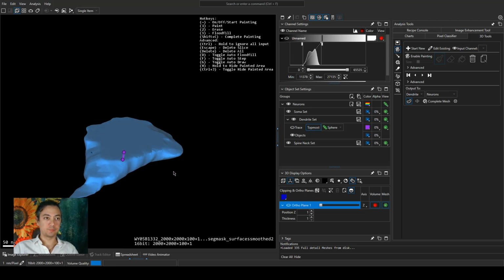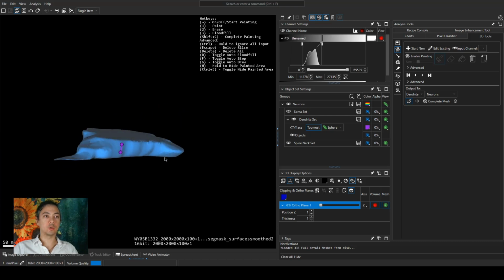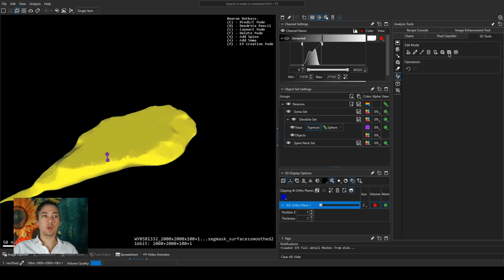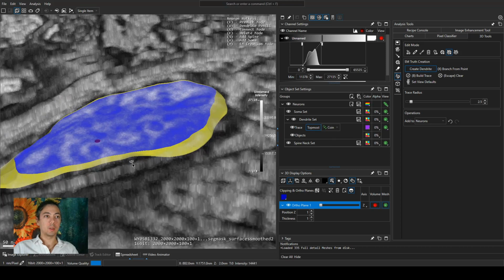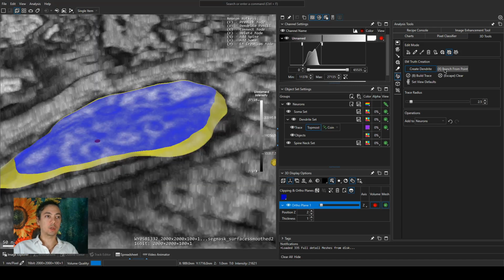there it is. So the last thing you might want to do after you've adjusted any contours that you wanted to is fix up the center lines. And so I actually like coin mode, and we're going to use the EM create mode. Oops, need a channel, and then like this. And we'll say we can use branch from point. So we'll just look at it real quick. So it's not very thick, it's just got a top and bottom.